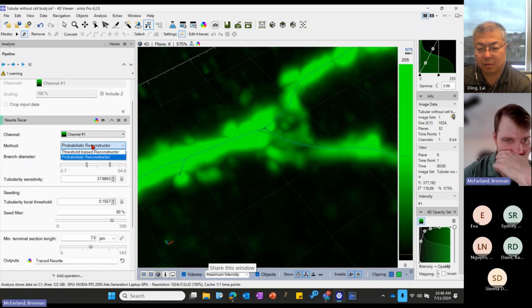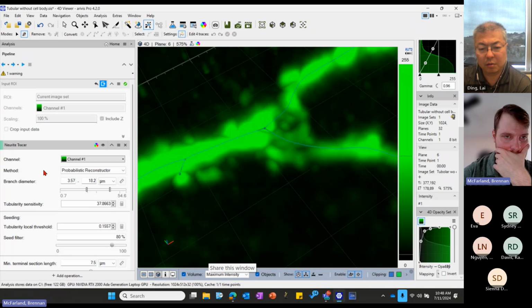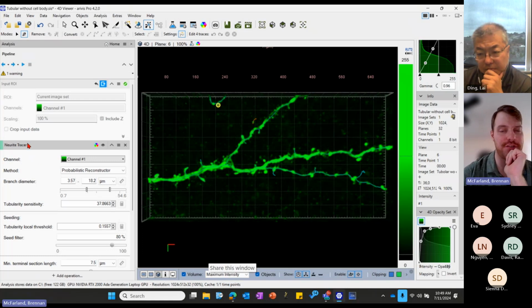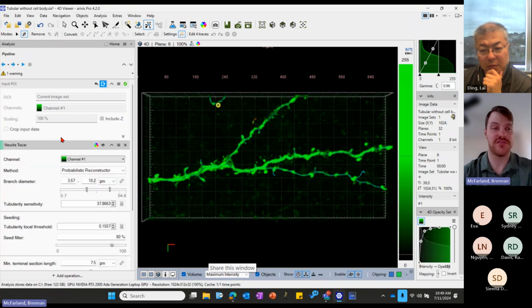Let me see if there's anything else. Okay. All right. So I think that covers neurite tracing. Now we'll go into neuron tracing.